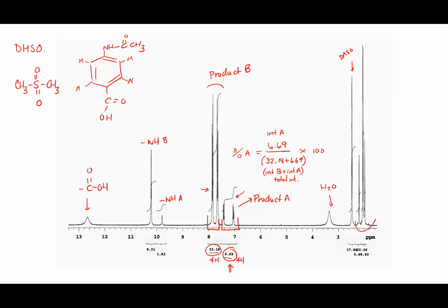Since I only have my phone here, I'm going to need to add up 32.18 and 6.69.